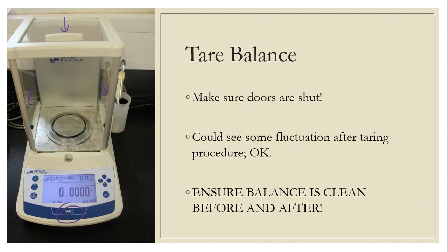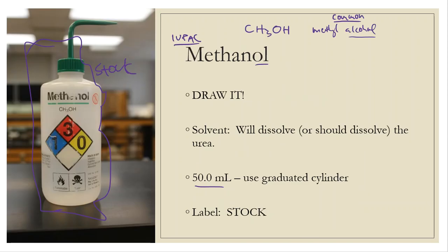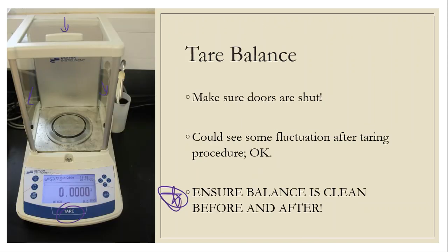All right. Also down here at the bottom, notice big bold letters: ensure that the balance is clean. I want to make sure that the balance is clean before and after I use it. It seems like this is always a problem. People go over and they pour their stuff on a weigh boat and they walk away and they never clean up after themselves. It's like sleeping at somebody's house as a visitor and you refuse to make up the bed. I mean, why do you do that? All right? Manners, people. Manners. So take the sheets off, at least, because you know they're going to wash them, or at least I hope they're going to wash them.